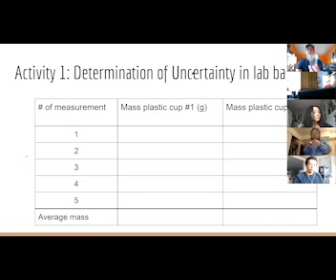What do you think the tolerance is in the factory that produced these for making them exactly the same mass? Probably not very high, right? I doubt that these are made to be within like 0.01 grams of each other. That would take a lot of work to make the difference so small that probably isn't worth it when you're just making plastic cups for a living. So you're probably not that worried about the difference. So the difference we see in the mass has to be within the mass of each cup.